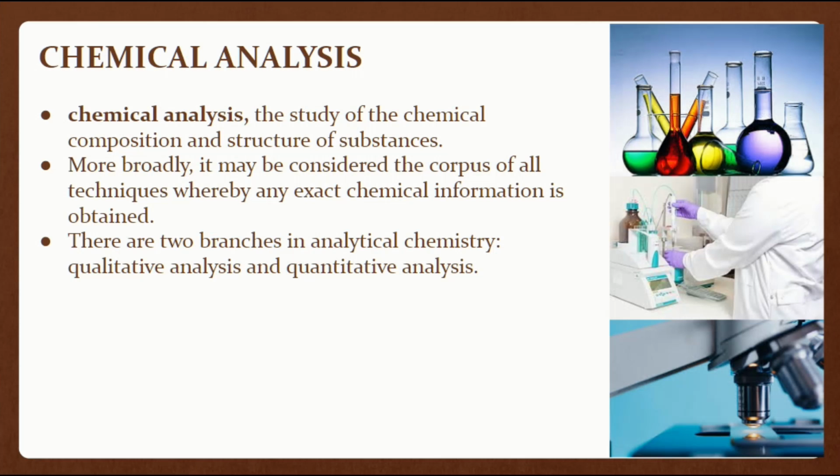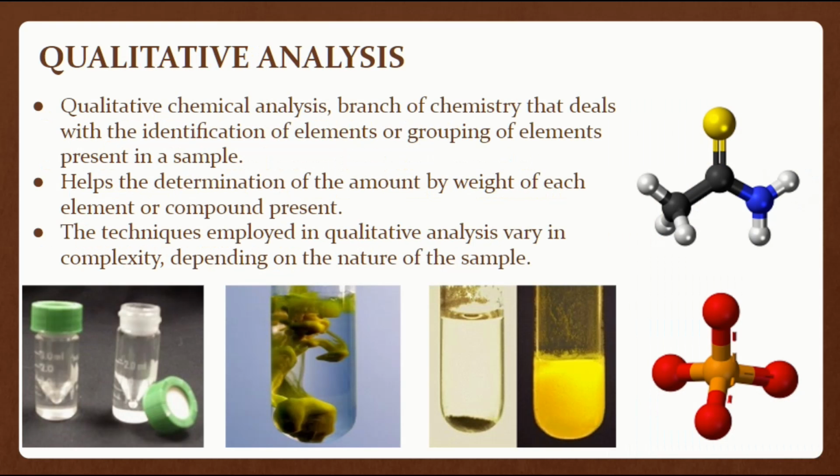Chemical analysis is the study of chemical composition and structure of substances. More broadly, it may be considered the corpus of all techniques whereby any exact chemical information is obtained. There are two branches in analytical chemistry, qualitative analysis and quantitative analysis.